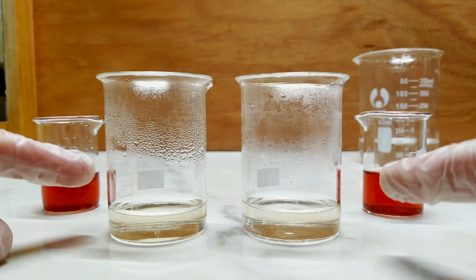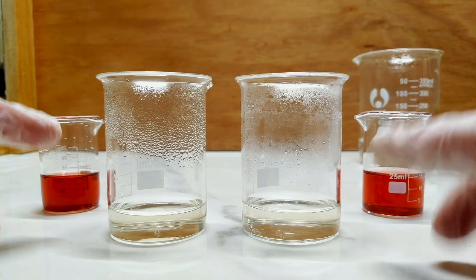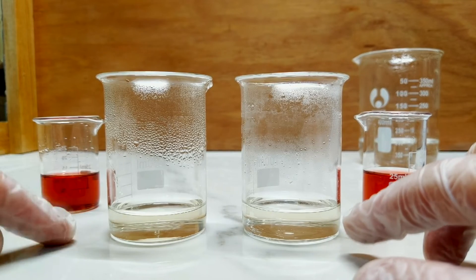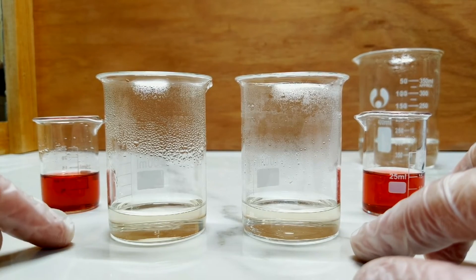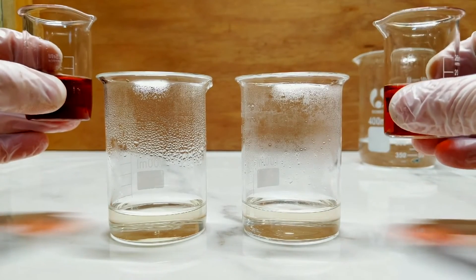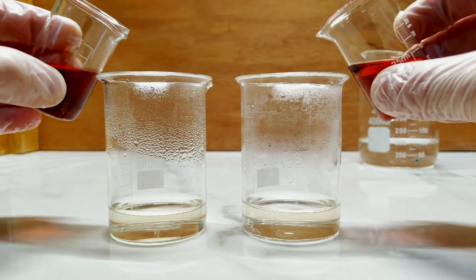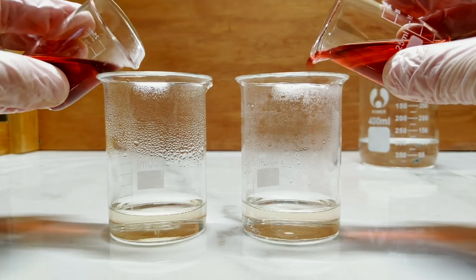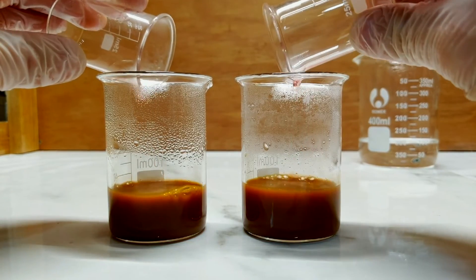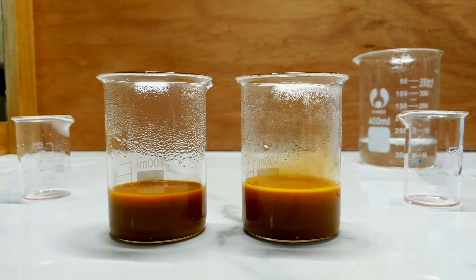I thought I'd get nice and close in to show you the result of what's happening here. The one on the right-hand side has the additional sodium chloride, and the one on the left is just the straight solution. And so now I'm just going to add my acidified cobalt solutions to both of my potassium nitrite solutions, and we shall see what happens. Pretty much immediately we're getting a little bit of fizzing.